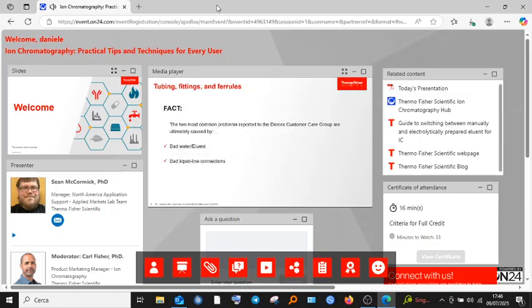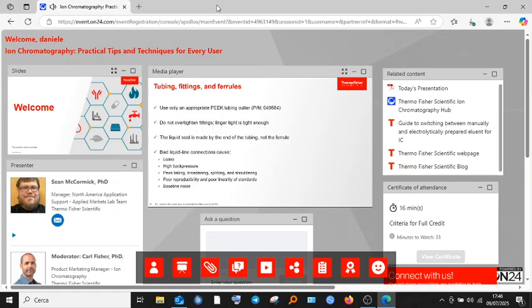One aspect of my job is to interface with our tech support team. While doing so, we've determined that the most common problems that our customers face are typically related to bad water or eluent and bad liquid line connections. We've already discussed the need for high quality water and taking care in the preparation of your eluents, but let's spend a moment talking about tubes, fittings, and ferrules.